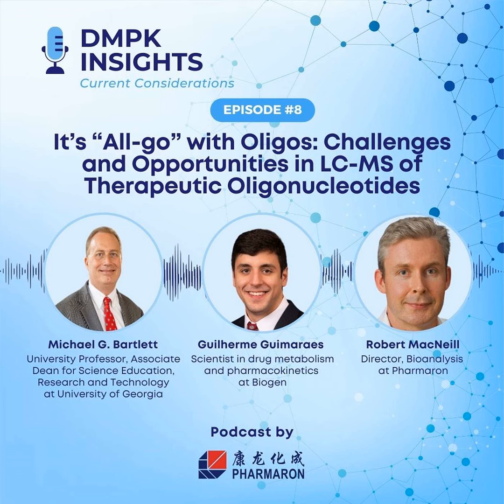Yeah, I think it's been surprising actually how long it took people to really start looking at HILIC. But there were some obvious reasons to think that it was going to be successful. It improves the retention of polar analytes. And when you're looking at all the major classes of biomolecules, there are no molecules more polar than oligonucleotides. And we would expect it to improve desolvation in electrospray because you have such high organic content in the mobile phase. So I think HILIC holds a lot of key advantages.